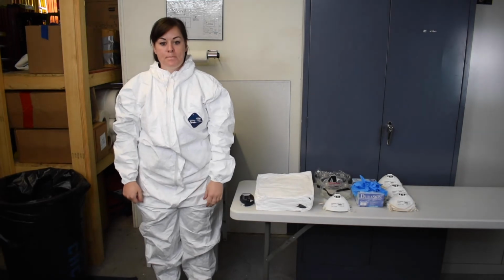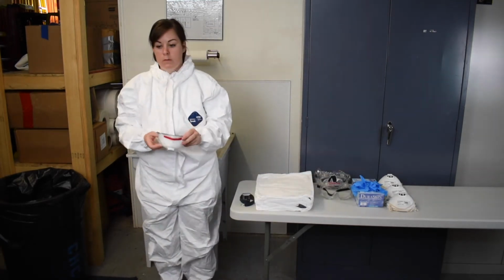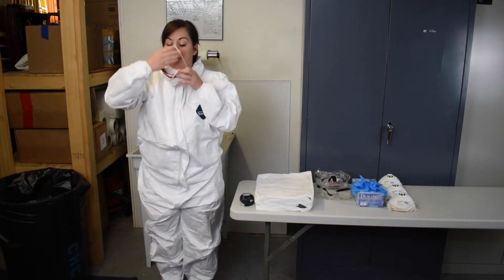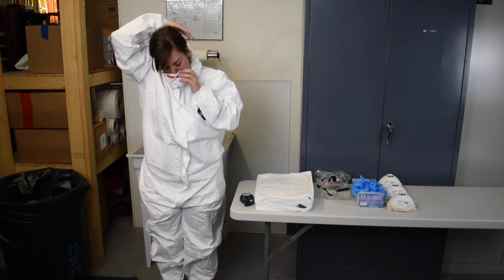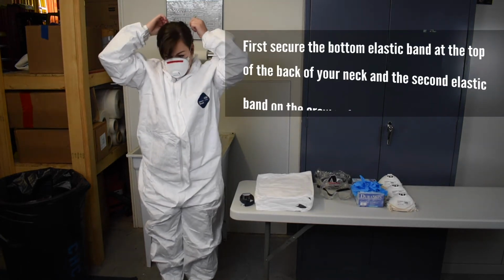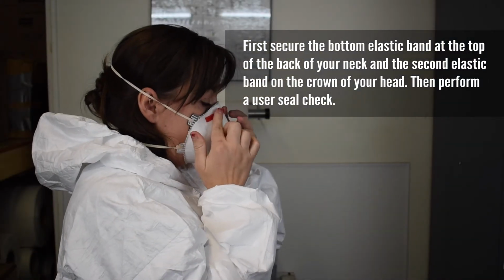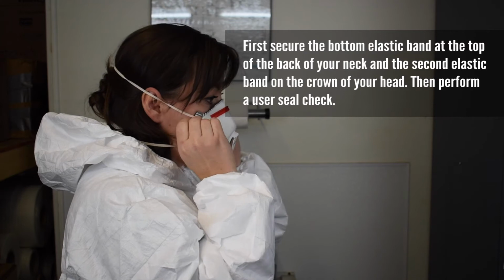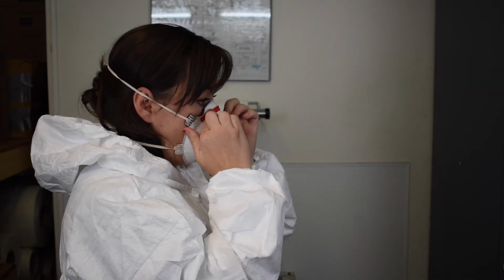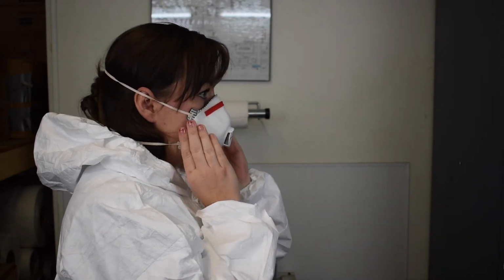Now, put on your N95 respirator. Healthcare workers wearing N95 respirators should have been medically cleared and fit tested prior to wearing a respirator. The N95 bands should be placed by first securing the bottom elastic band at the top of the back of your neck and the second elastic band on the crown of your head. Then, perform a user seal check of the respirator by pressing firmly on the malleable metal band located at the nose of the respirator to ensure a snug fit.